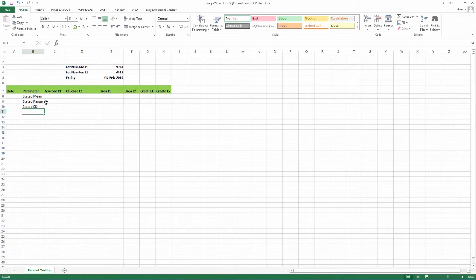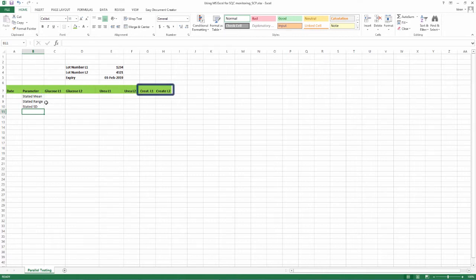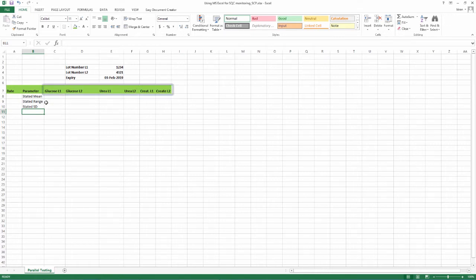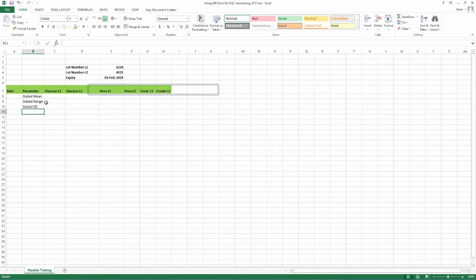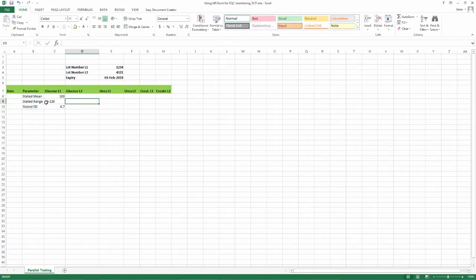stated range and stated SD all obtained from the QC insert. Mark rows for all analytes of interest for each level of QC. In the example, glucose, urea and creatinine are shown for two levels as generally routine chemistries have two levels of QC. Continue for all analytes the quality control is being used for and depending on the tests available in your lab. Fill in available data from the QC insert as shown for glucose.